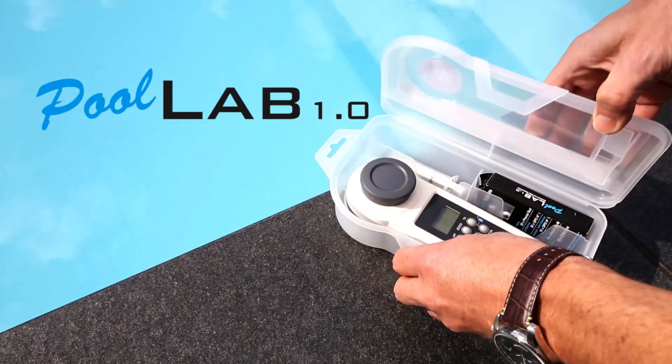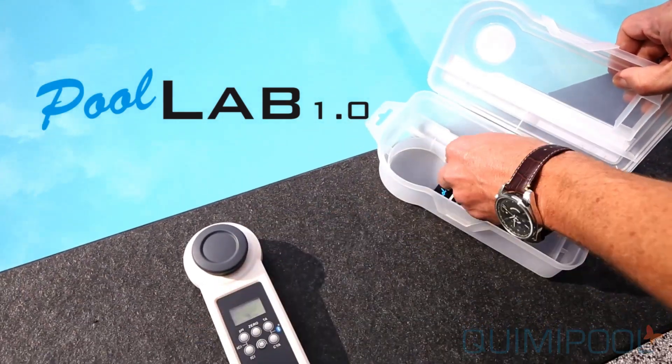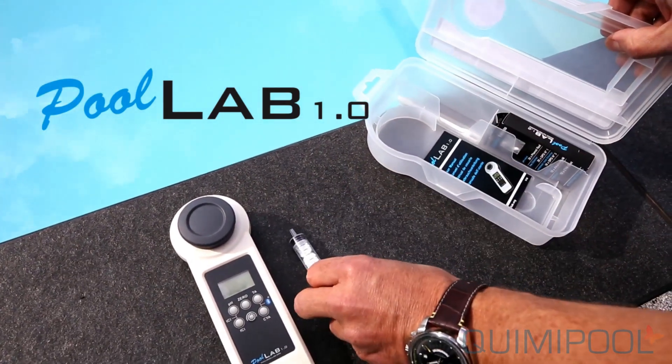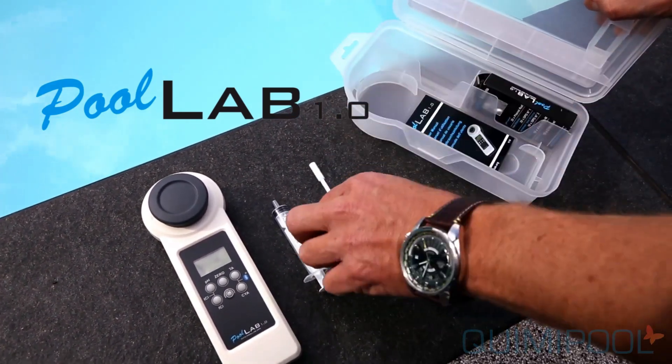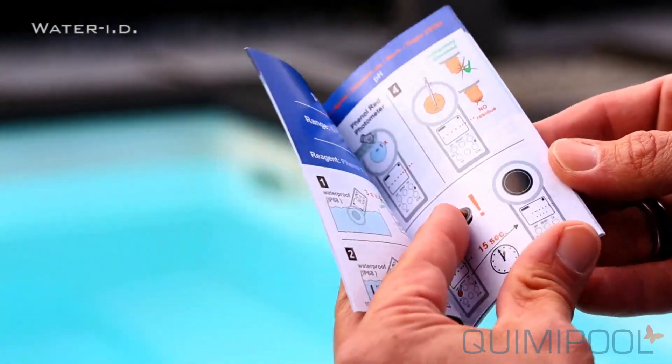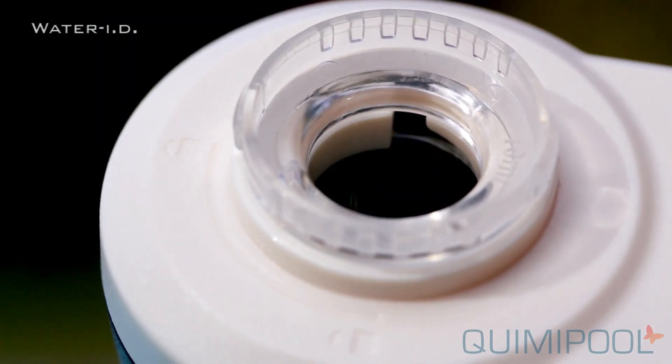The PoolLab 1.0 Photometer is a professional water tester to measure 11 important water parameters such as chlorine, pH, cyanuric acid, alkalinity, and 7 more. Due to the use of three wavelengths, the PoolLab measures with high accuracy.